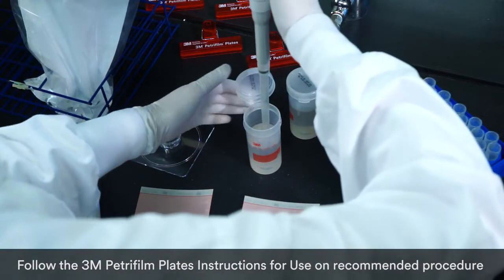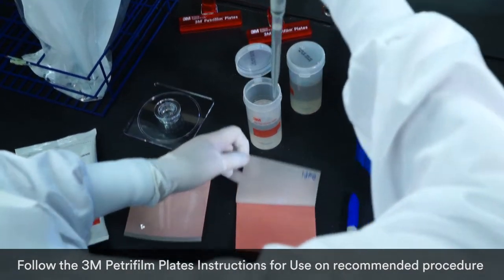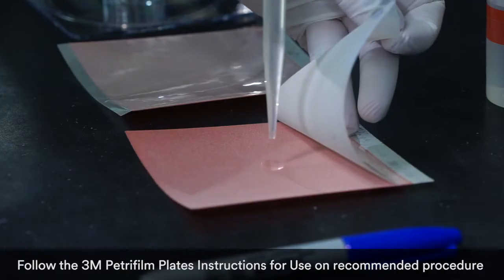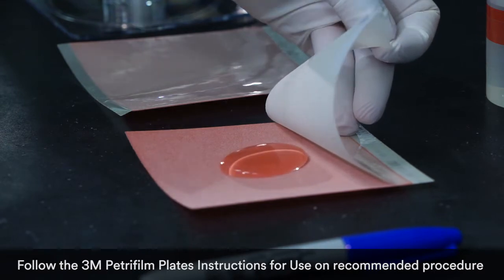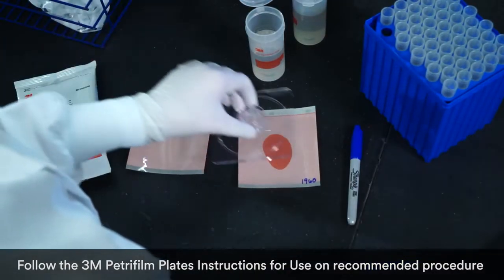Step one: inoculate. Each pack of Petrifilm plates contains uniform testing media. You just open the pack, take out one plate, lift the top film, and dispense five milliliters of the prepared diluent onto the center of the bottom film. No cumbersome, time-consuming agar prep required.